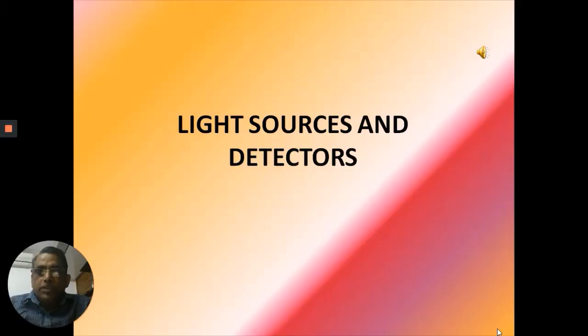Today we will discuss the light sources and detectors that are used in fluorescence spectroscopy as well as photochemical experimentation. There are a variety of light sources available commercially, and we have to identify the right sources for your instrumentation and use them for appropriate and very good performance.